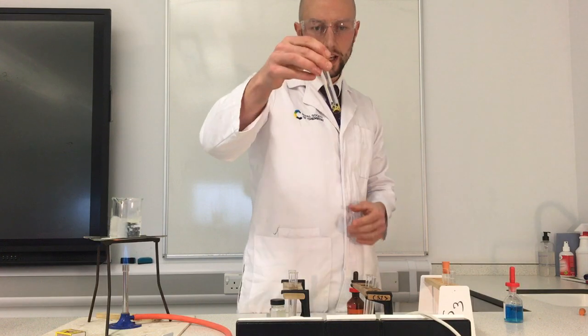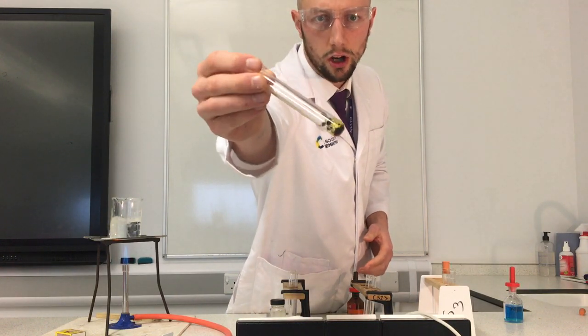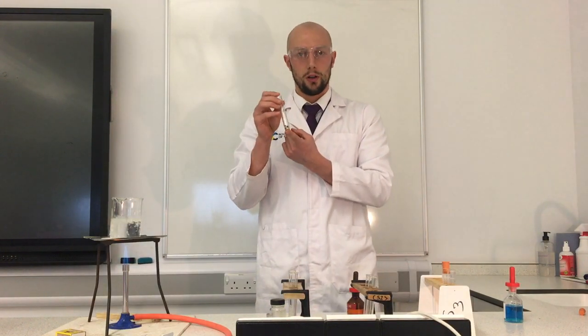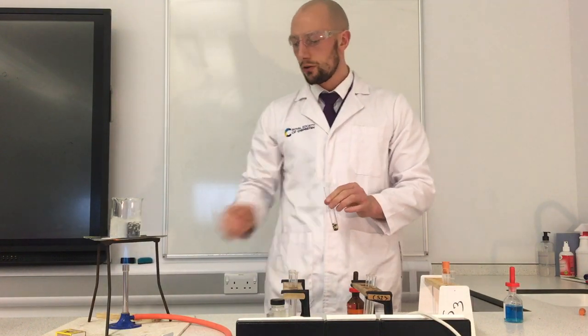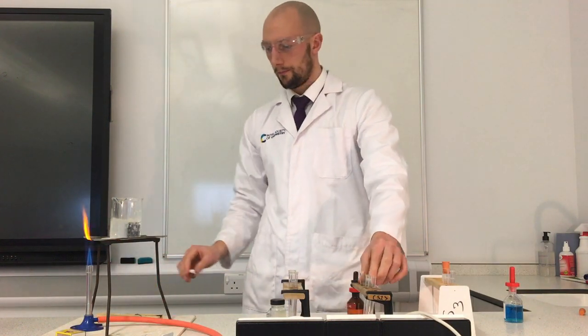I hope you can see that where the iodine has touched the rice cake, it's gone dark blue. That's the blue colour we were looking for. That colour change tells me that there must be starch in the rice cake.